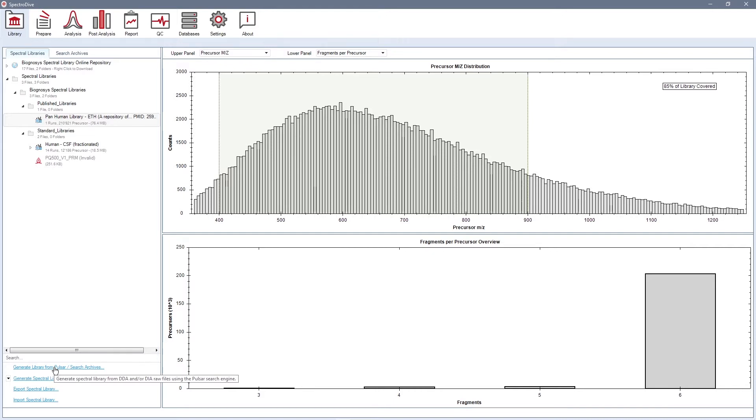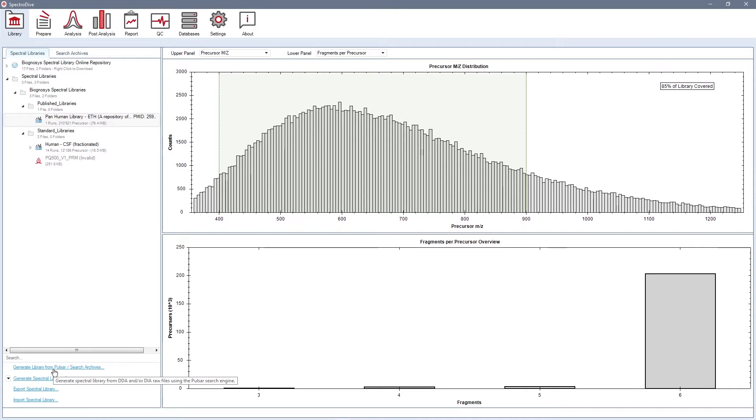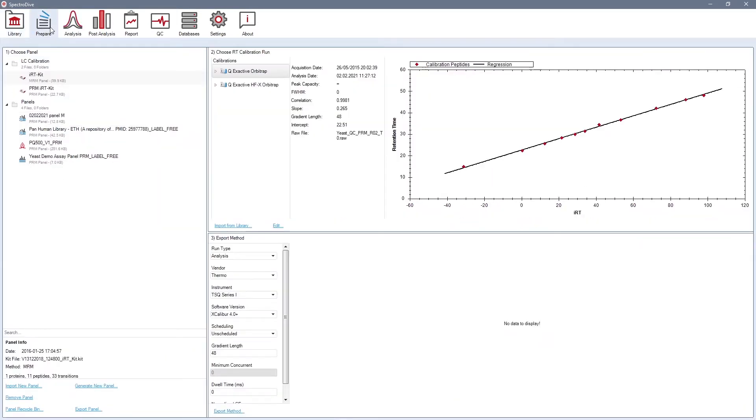Subsequently, such libraries can be used for the selection of targets and panel generation for the targeted assay. You can generate or import target panels in the prepare perspective. These panels will be then visible in the tree on the left side.